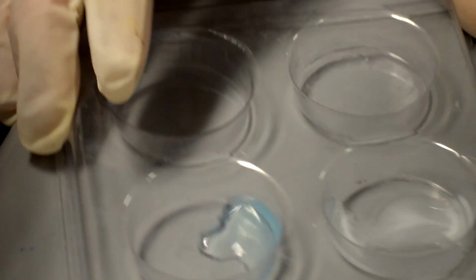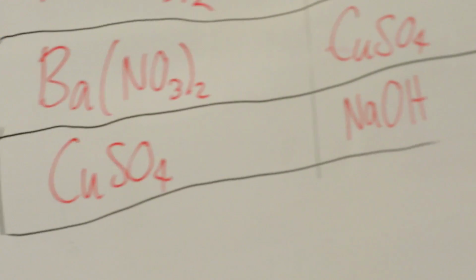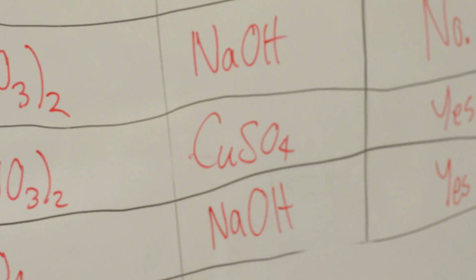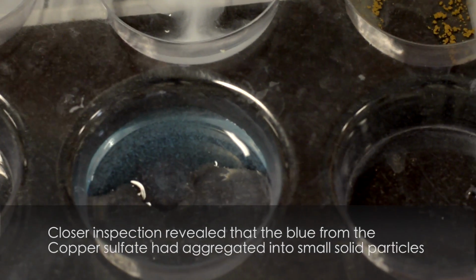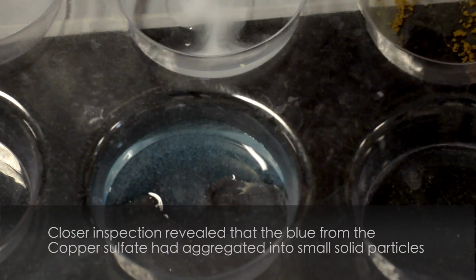Very teeny blue bits. Can you see any precipitate being formed though? No. Still looks pretty clear. So copper sulfate plus sodium hydroxide. Failed, did we? No, but it might be the other combination. On the board we predicted that the precipitate would be formed. Double checking it now on a dark surface, we can see tiny speckles of blue particles. That's a solid, that's the definition of a precipitate.